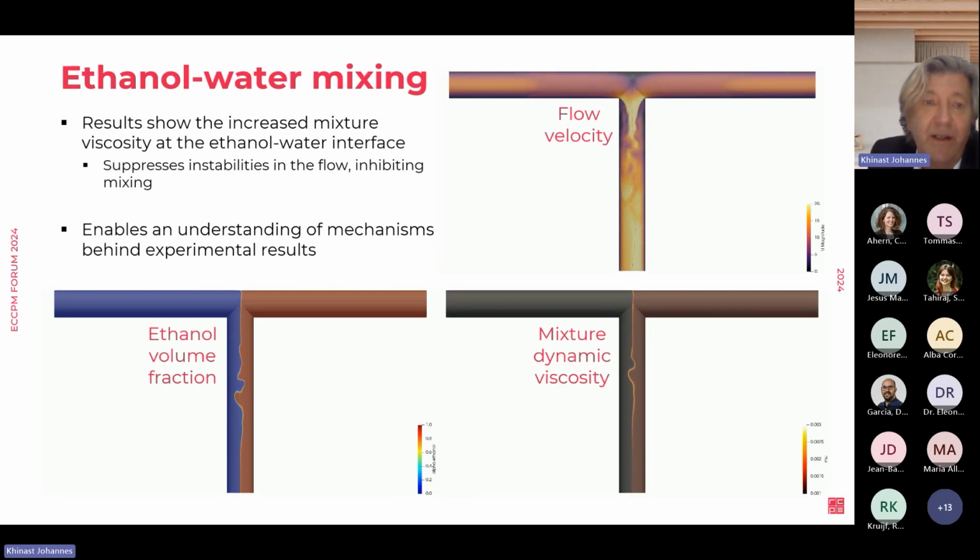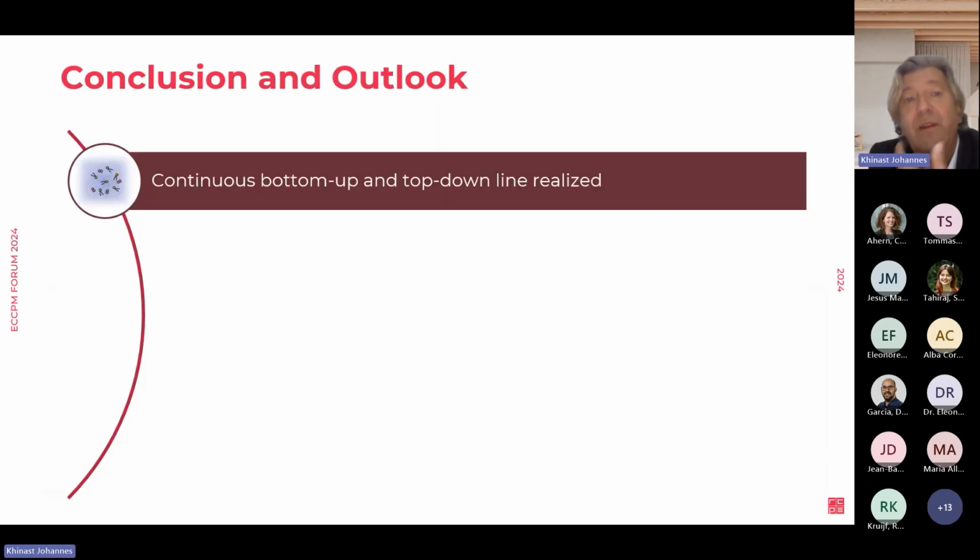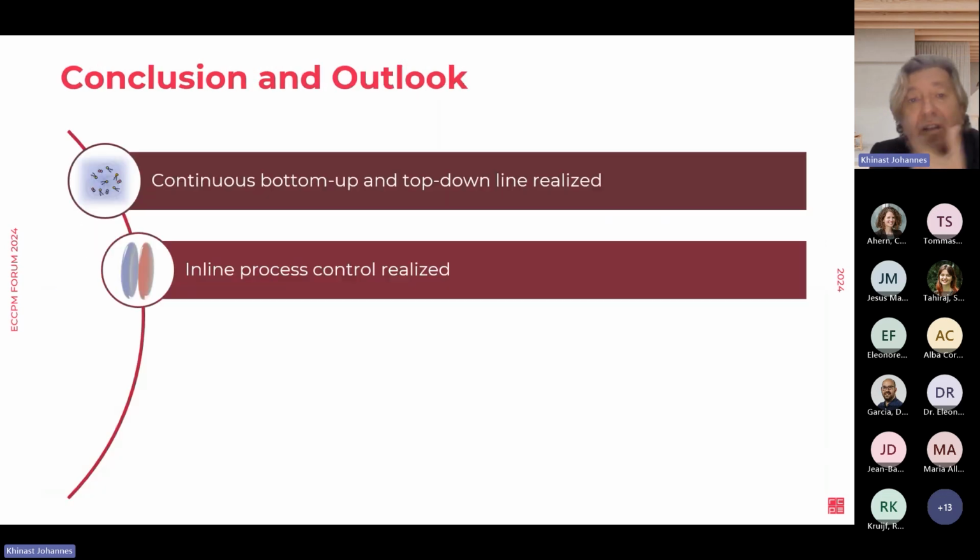this impingement jet mixes, and we can use this information now to understand how particles, nanoparticles are forming, how they're loaded, what's the quality, what's the polydispersity index, how process parameters impact the quality. All of this can now be done. We're not completely finished with this. So this is something which we'll need to do over the next years and refine and continue to work. But we started, and there are good results already.